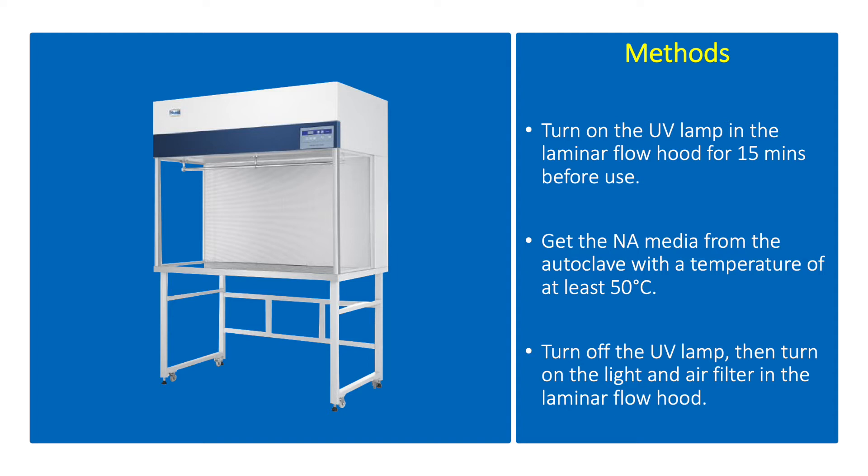Turn on the UV lamp in the laminar flow hood for 15 minutes before use. Get the NA media from the autoclave with a temperature of at least 50 degrees Celsius. NA media solidifies at 42 degrees Celsius, so it is important to pour the NA media immediately after autoclaving.